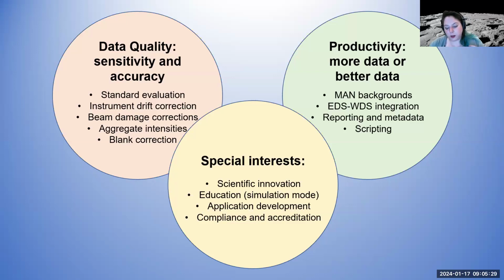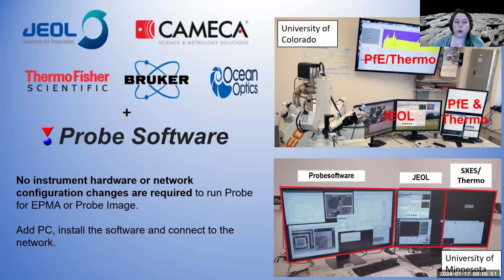Oh yeah, and I should mention, of course, I forgot it. So I said my name is Anette Vanderhand. I'm at the University of British Columbia. I run the electron microprobe there, and I've been using microprobes for around 2 decades now, and I think the probe software for around 15 years. So usually the probe software is installed alongside the actual vendor software.